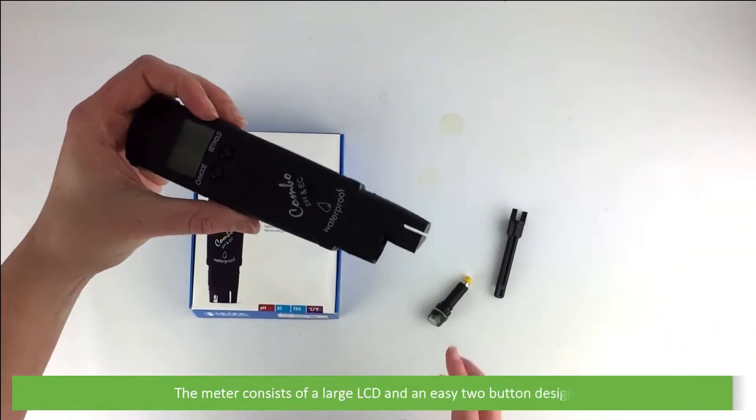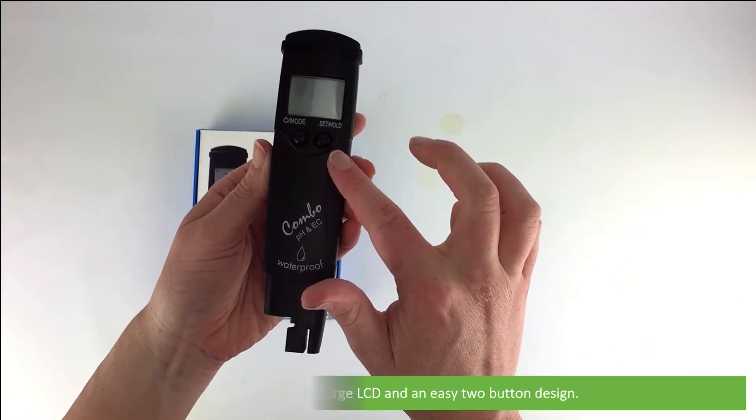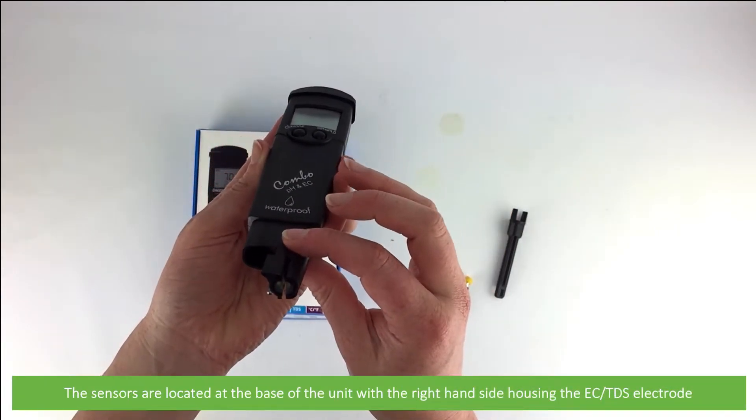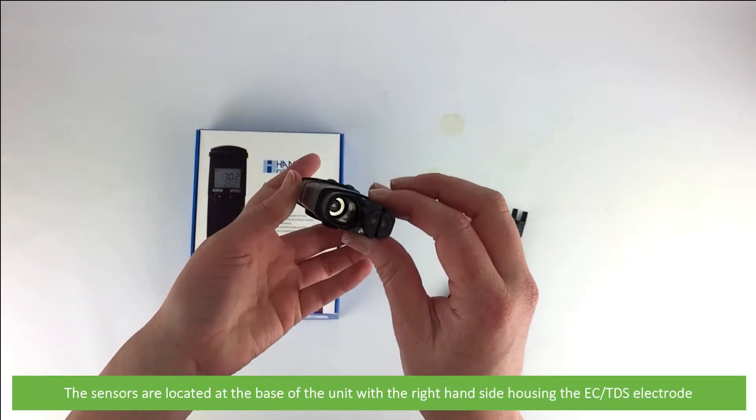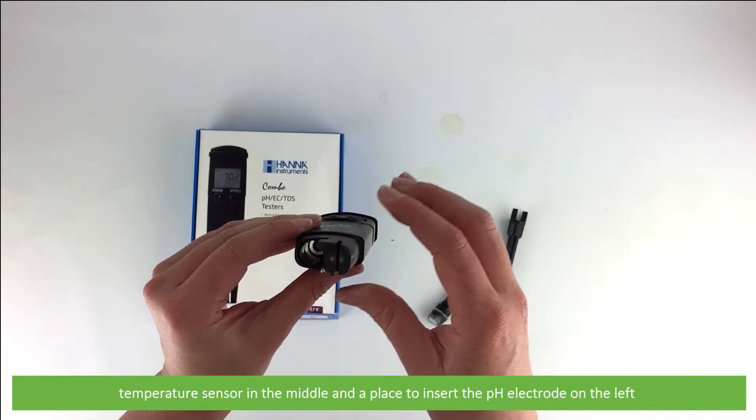The meter consists of a large LCD and easy two-button design. The sensors are located on the base of the unit, with the right hand side housing the EC/TDS electrode, temperature sensor in the middle, and a place to insert the pH electrode on the left.